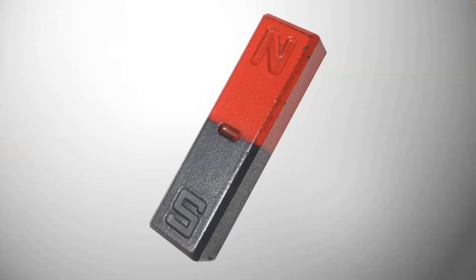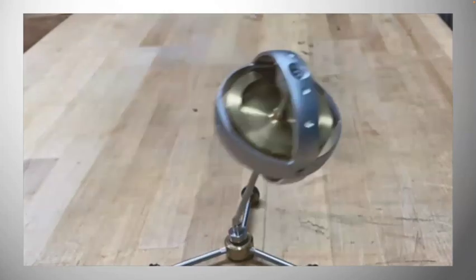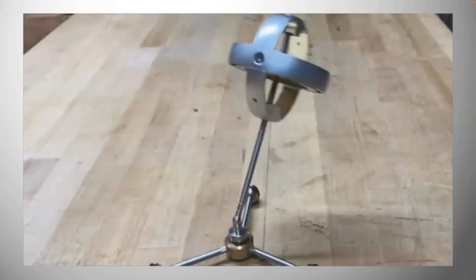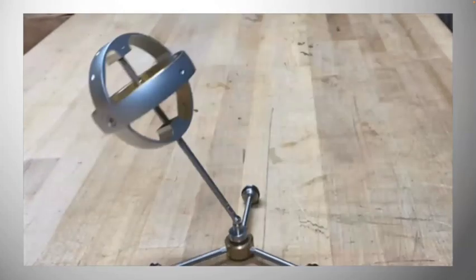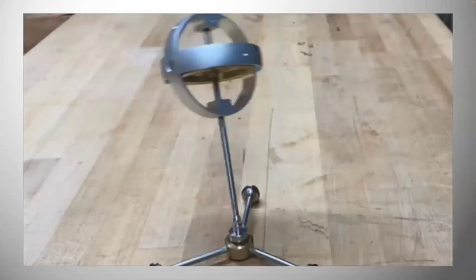It's actually more complicated than that, and I'll start to cover more complicated variations of this theme in later videos. But this works for right now, and it actually is a pretty good description. So you put your sample into the magnet, you have a bar magnet, it aligns with the magnetic field, then what happens? Well, when you put that sample into the magnetic field, those bar magnets start to behave like a gyroscope moving in the Earth's gravitational field.